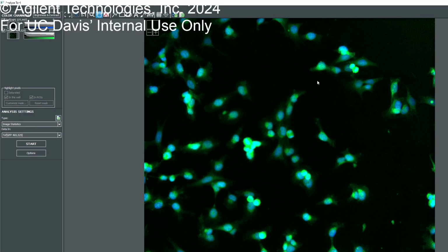If you just look at it in bright field without any labels, this is the whole cell boundary around it. So we always want to use that, which basically displays the whole cell. It's also very common to say DAPI, like 50% of the times people say DAPI, so don't mind that at all. That'd be good for the cell count.